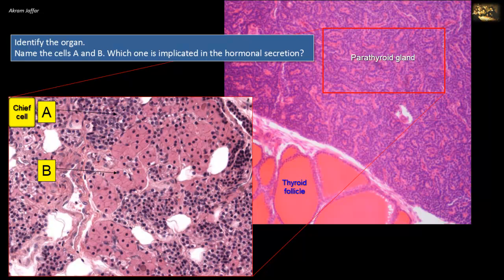The second cell type, shown in B, are the oxyphil cells. They are large cells with eosinophilic cytoplasm. The oxyphil cells of the parathyroid gland are clearly larger and more eosinophilic than the chief cells. They can be found in clusters, and their function is not clearly known.